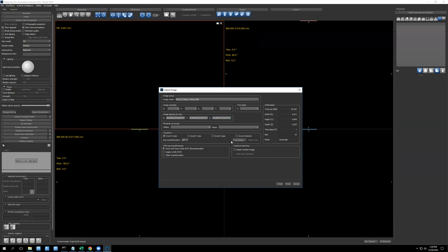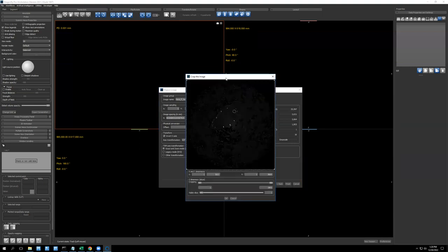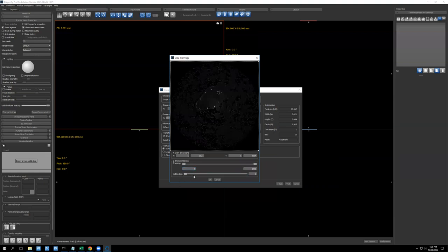The only other thing you have to do is open crop image. It gives you this. Down here, you can go through the slices. It's very dark, strangely dark, but doesn't matter. Go through the slices and you're going to change your data in 2 ways.